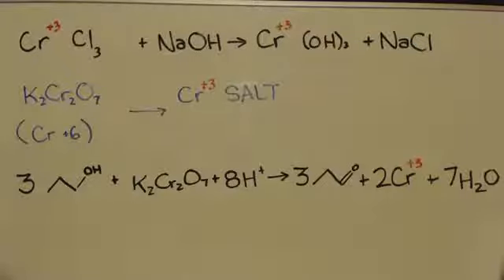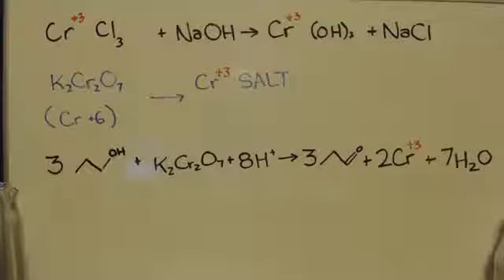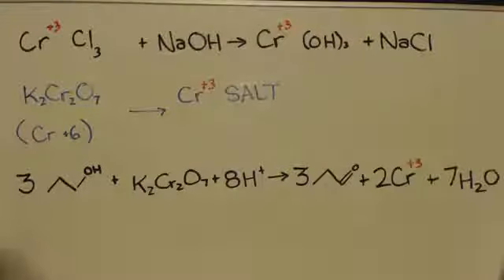precipitates out, okay? Now all you got to do, since it's a solid and your byproduct is sodium chloride, let all of the insoluble precip, the chromium hydroxide, settle to the bottom. Then siphon out the water, throw some new water in there that's nice and clean, soak up some more sodium chloride, siphon it out, throw some more clean water in there, and do that about 5 or 6 times until you have a very clean chromium hydroxide product.